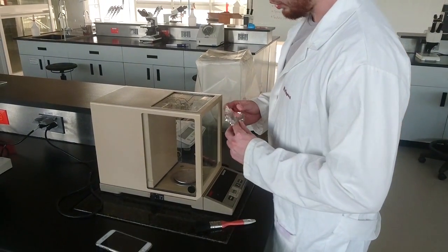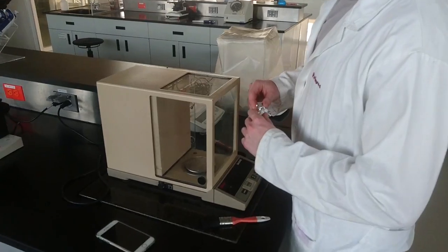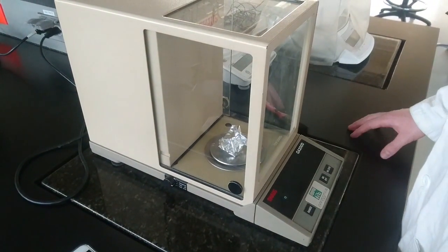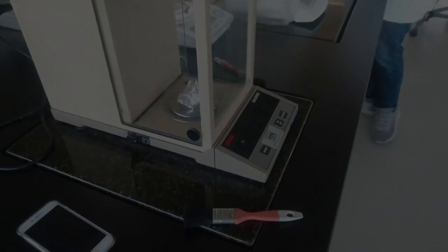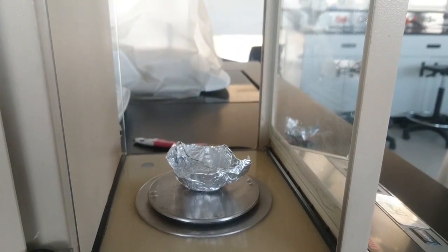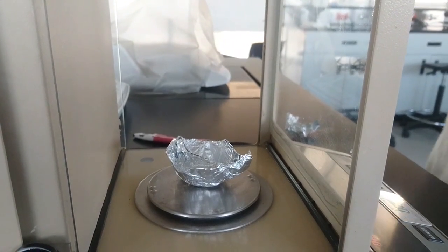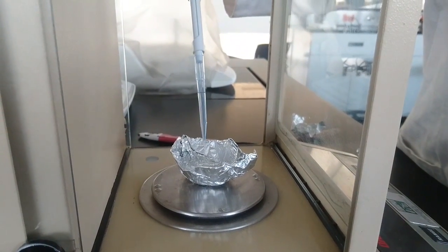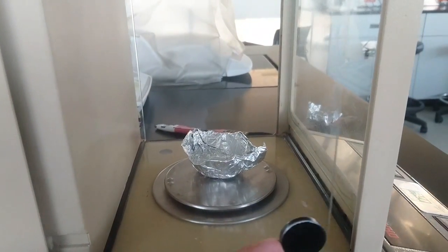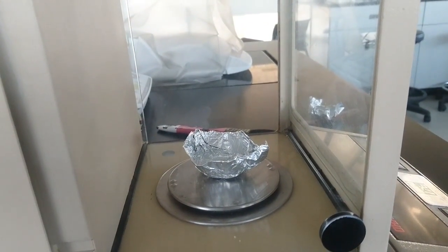The weight was recorded, the next volume was deposited and registered, until the total of 10 measurements was collected. At the end, the average and the standard deviation of the three data series for each micropipette were calculated, and a graph was obtained to observe the error margins.